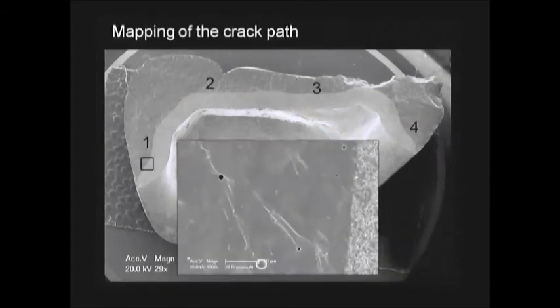Number 1, I focus on the veneering ceramic. And what's the name of this? Wake hackle. Direction goes from bottom to top. This is the alumina core material, so you all agree it goes up. Number 2, you already can see lots of little faint lines here, okay?